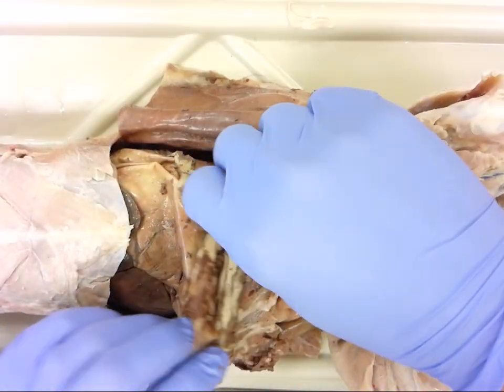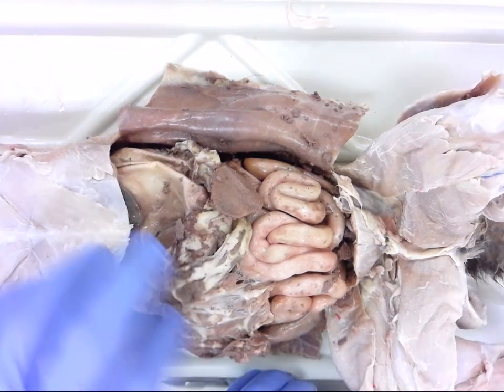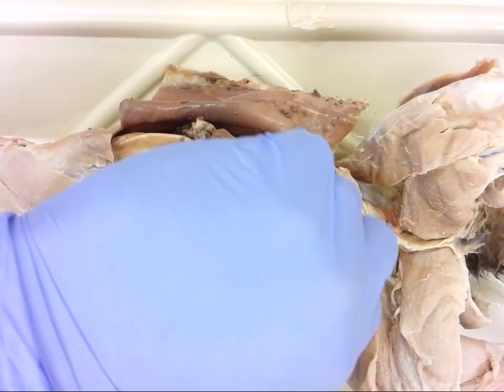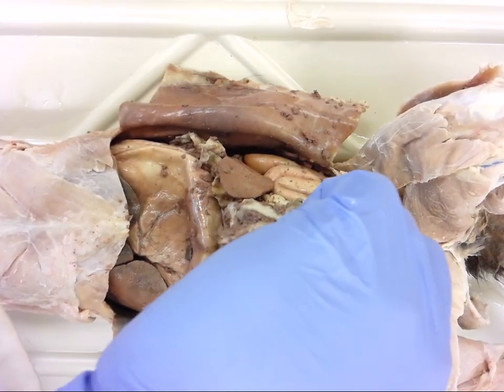So what I'm going to do for our purposes, we're going to go ahead and remove it. So anywhere that I'm just lifting it up, and anywhere that it's attached, I'm just going to sort of cut it away. We can discard it, get rid of it after you've made some observation.